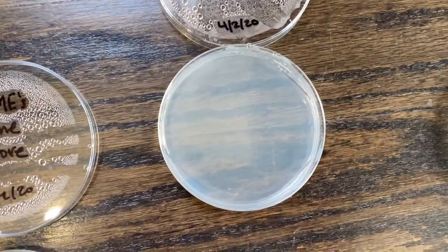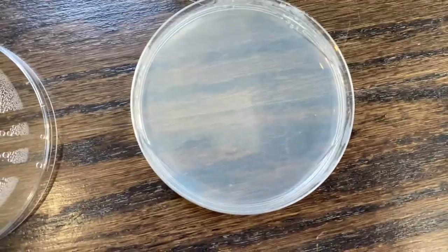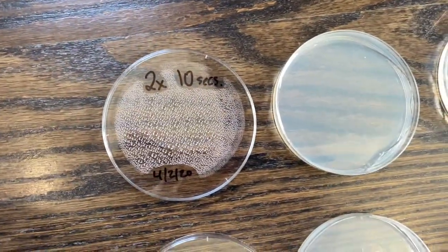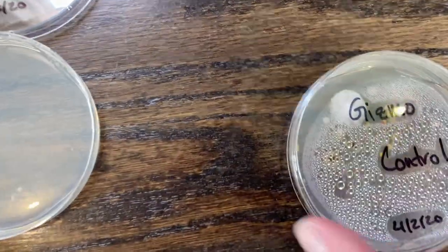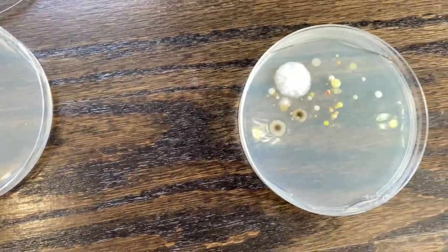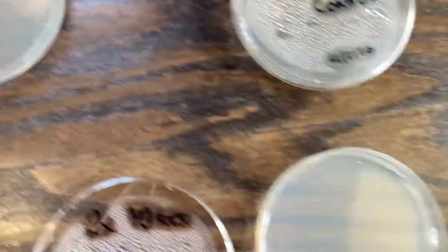And the control which should have nothing in it — thankfully that worked out. And we're going to get to the gross one here. This is the Gizmo control — just touching and not washing my hands. Oh my god, gross. It does not look good.